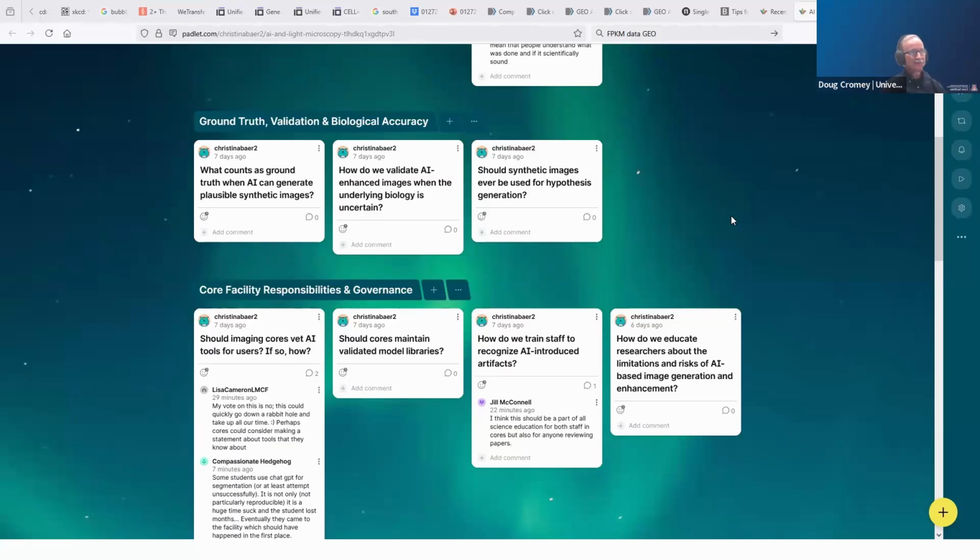If the knife is old and chattery, there are just a lot of variables that I'm not sure can be compensated for or even thought about, because users don't consider all those variables.